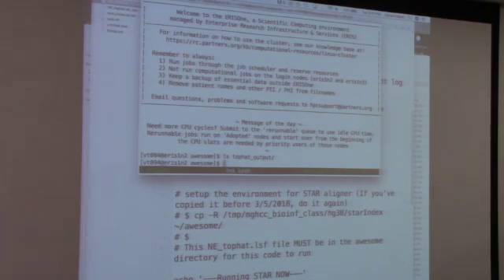Alright, it's done. Is it working? Did you get any output? No, right? I don't know. Wait, what's the output file mean? Which actually didn't make the directory. It's all different, yeah.